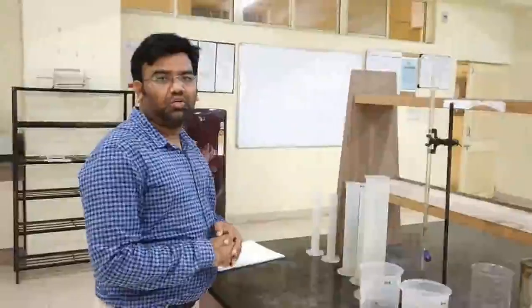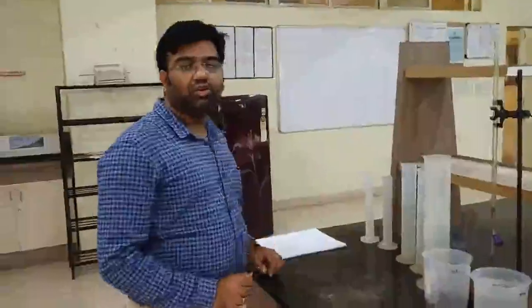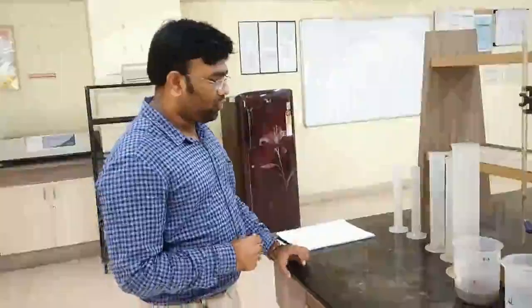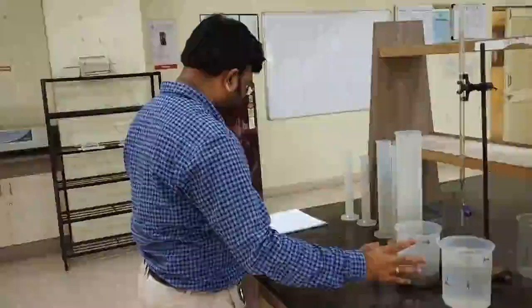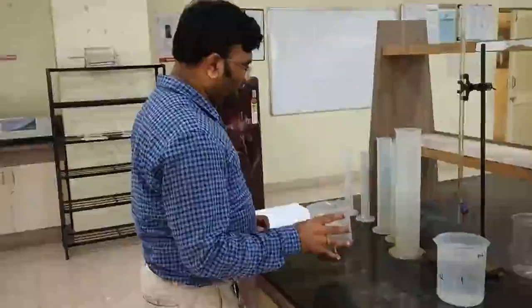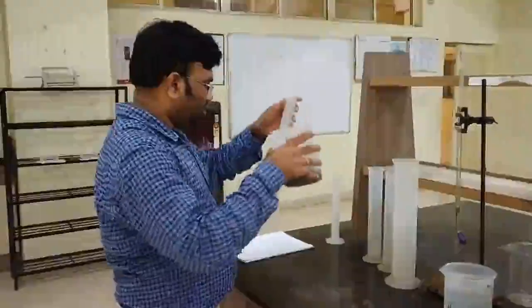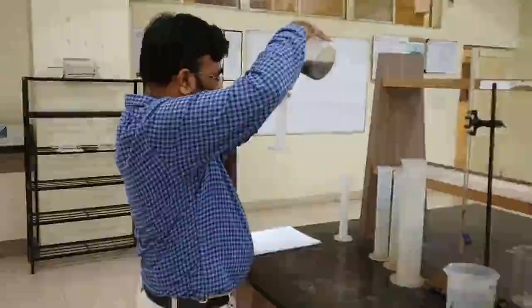We are going to see how to do the double dilution. For example, we are going to do the double dilution for achieving a dilution factor of 400. The first step in the double dilution is to take a 25 ml sample and dilute it to 250 ml. So I am going to measure the 25 ml sample with a 100 ml measuring cylinder.